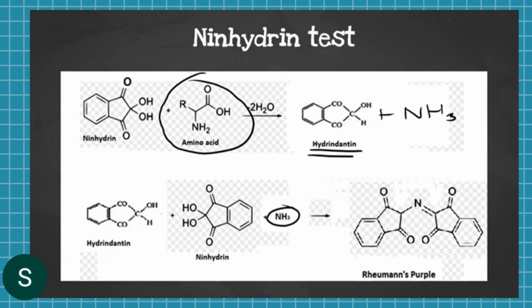So, ano bang nangyayari? Bakit yung proline hindi siya nagpo-produce ng purple color? Because your proline is a secondary amino group. Again, your ninhydrin, when mixed with your primary amino acid, dun lang siya nagka-create ng ammonia. Dun siya nagpa-produce ng byproduct na ammonia. Therefore, producing a purple solution. So again, yung proline, pag mix siya with your ninhydrin, babalik lang siya into amine. Kasi ang magiging product niya is your hydrindantin plus NH2 only. Okay? Wala siyang ammonia.